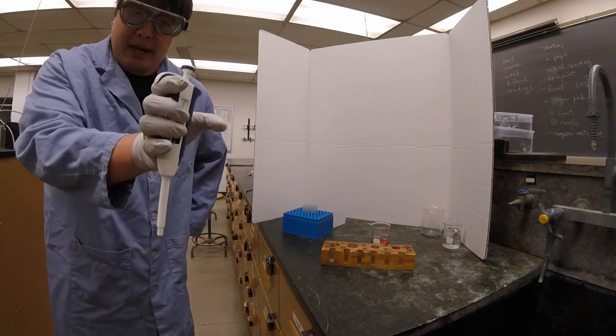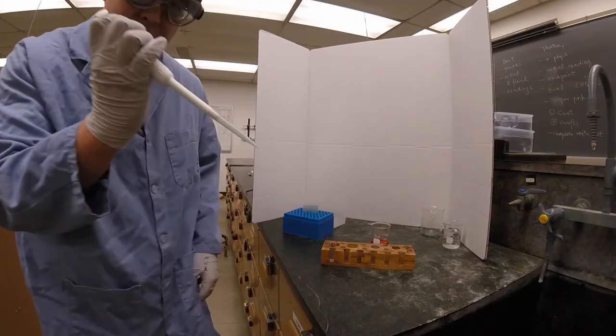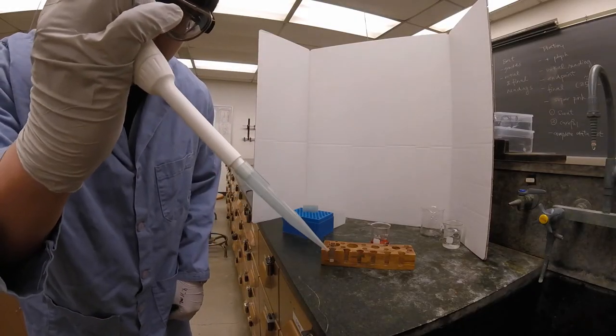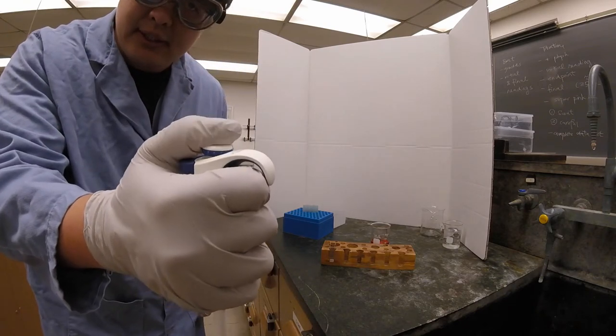So in order to use a micropipette, first you want to grab a tip over here. So now you can see that there's a tip attached to the micropipette, and then you want to go down to the first stop, like this.